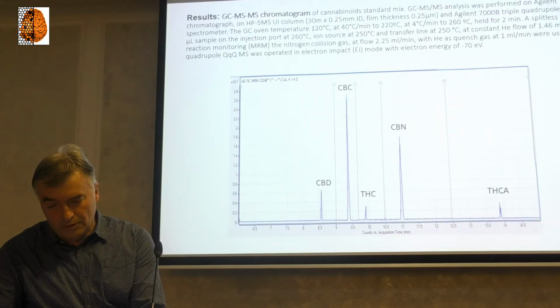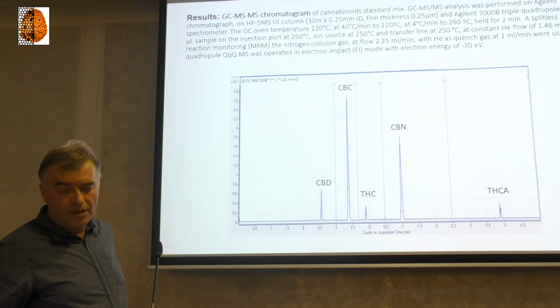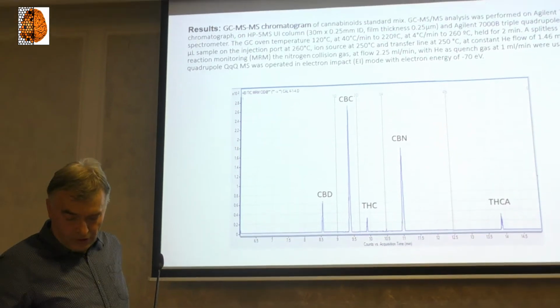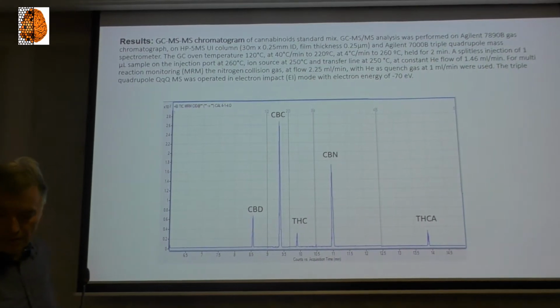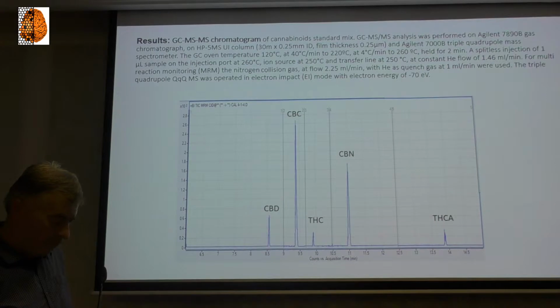Let me show the chromatogram of a GC-MS measurement of standards, just to give an impression of how chromatographic resolution is obtained with the parameters which are described here.